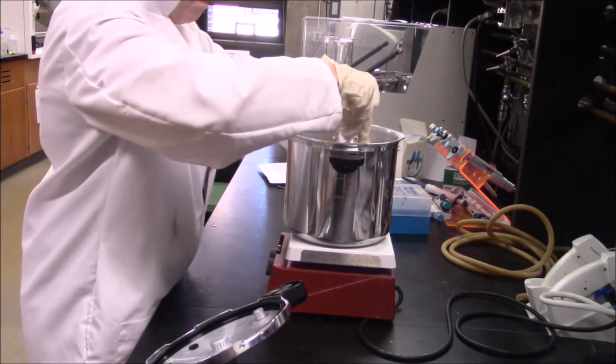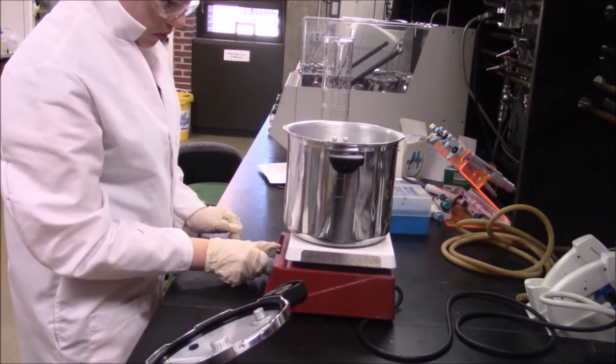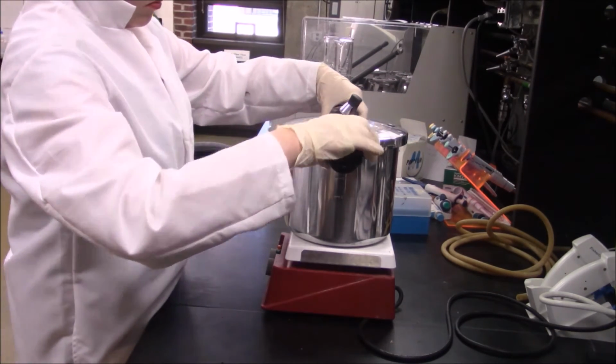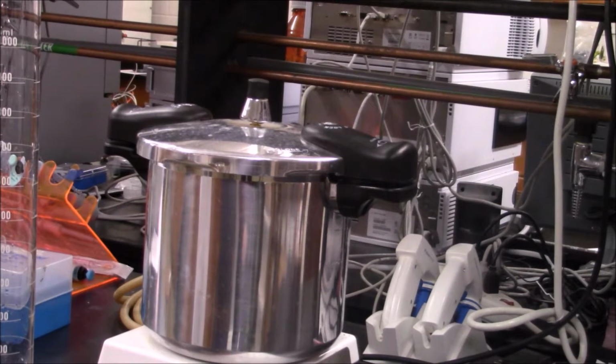First, place the pressure cooker on the hot plate. Add 1 liter of water to the bottom of the pressure cooker and then carefully place both flasks in the pressure cooker. Place the lid on the pressure cooker and turn the seal. Then wait for the water to come to a boil.